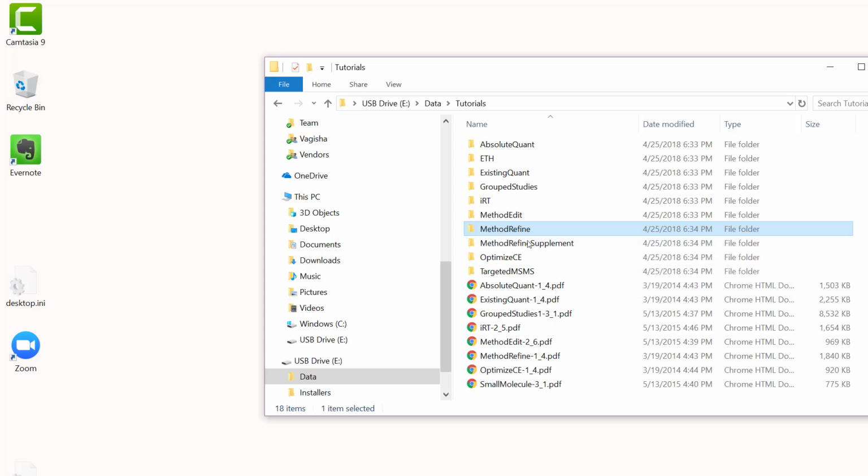It's label free, but it might look a little bit like an assay development, where you start with a bunch of things and you're going to get rid of some stuff, because for whatever reason at this point we're going to get rid of stuff that we just don't think we can detect.